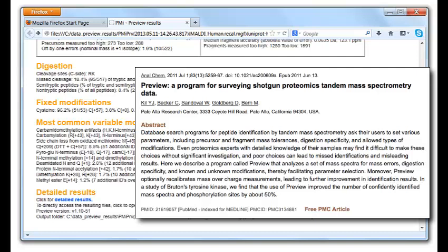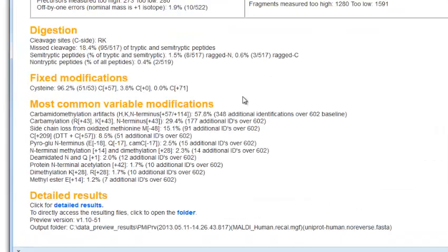Biological PTMs, however, are protein specific, so if there is a PTM that is of particular interest, you should always look for it in the full Byonic search, whether or not Preview reports that it's in the sample.